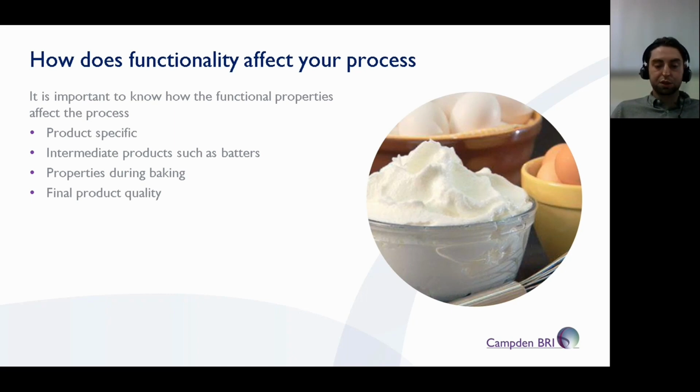do similar measurements to the egg oscillatory measurements on the rheometer. We can do that with cake batter. One of the barriers that are there for cake batter is it's very difficult to analyze the rheological properties of cake as it expands. However, we can take the air out, and we can do the rheological properties of once we've used a vacuum to remove all the air bubbles, so there is no expansion.